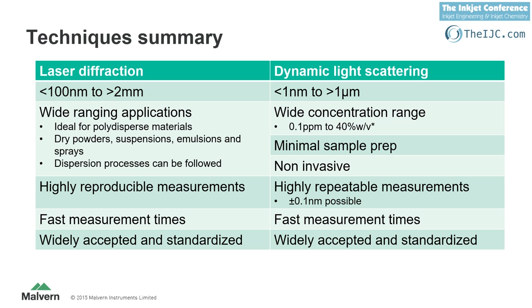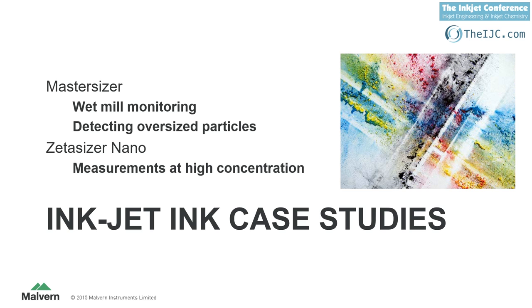Both measurement techniques are very reproducible, very repeatable. They're also very quick, and both have ISO standards which cover how the instruments work and what you can expect in terms of the performance of these instruments.